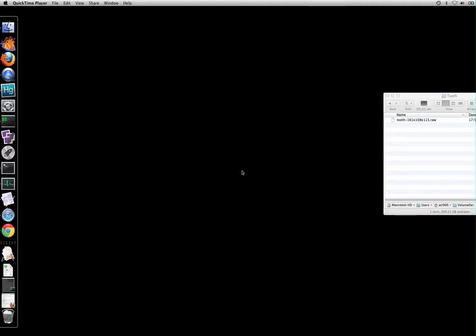This video will show you how to import data into Drishti. Now Drishti has two programs, one is the importer and the other is renderer.